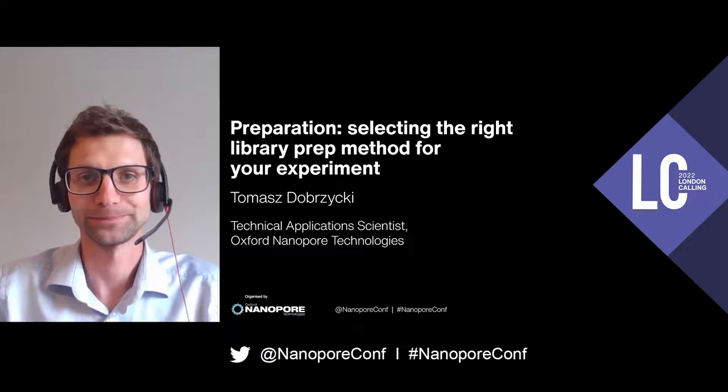In this masterclass, I will cover the main chemistries available for library prep in nanopore sequencing, and we'll also discuss which one to choose based on your priorities.